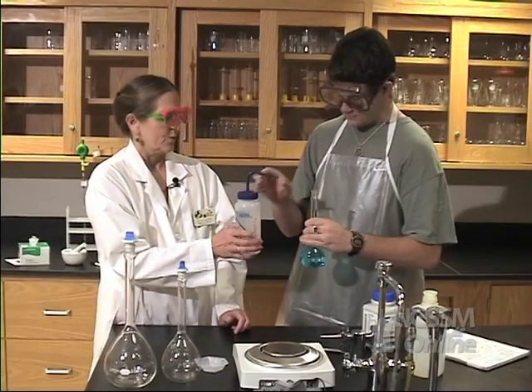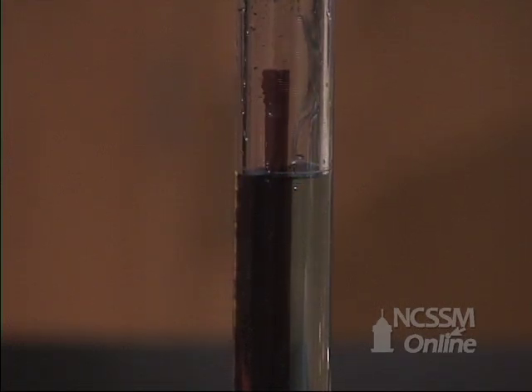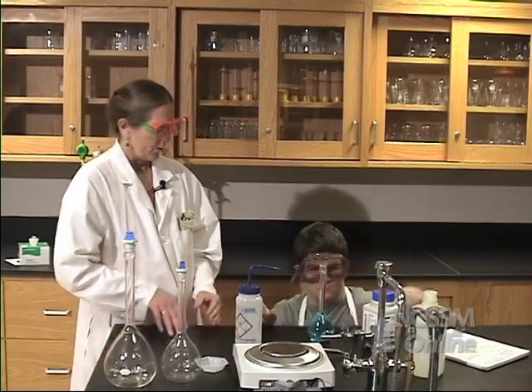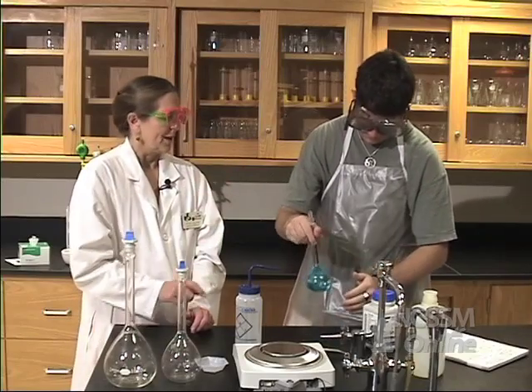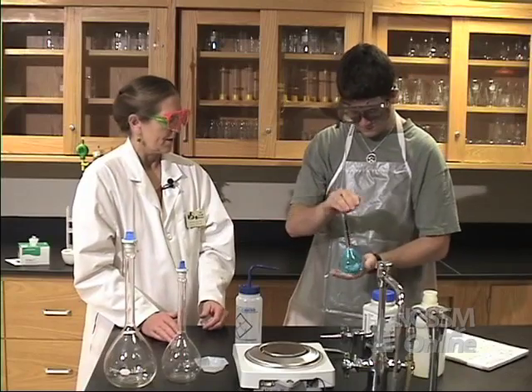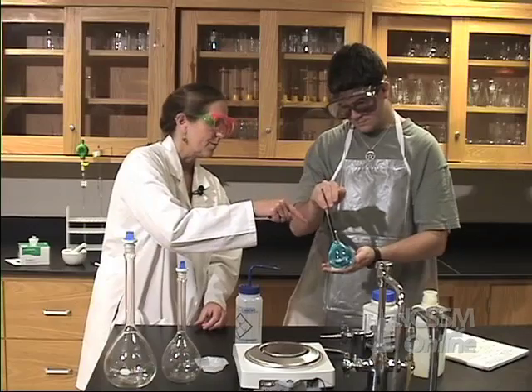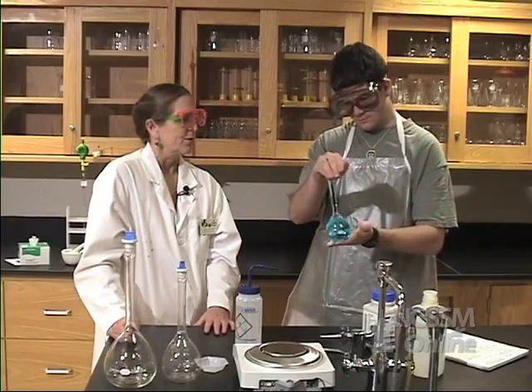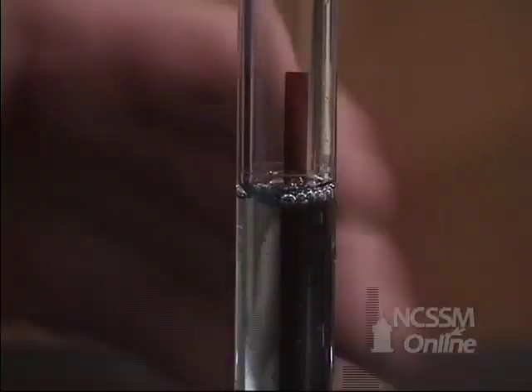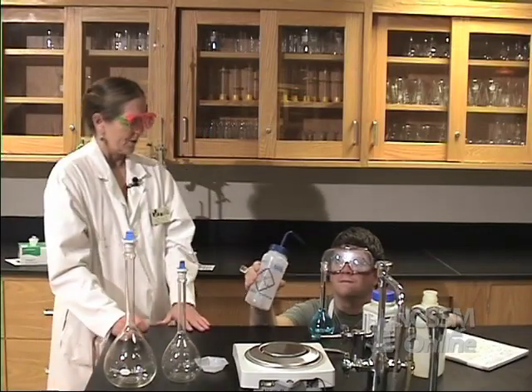That looks good. Now go ahead and fill it to the line there. Now you want to mix it up really well one more time, just to make sure that the level doesn't drop again. Hold it tight, turn it over again. You see how the meniscus is changing there? I'll read it and see if it's still at the line. Did it change? Yeah, it's a lot under it now. So add a little bit more.